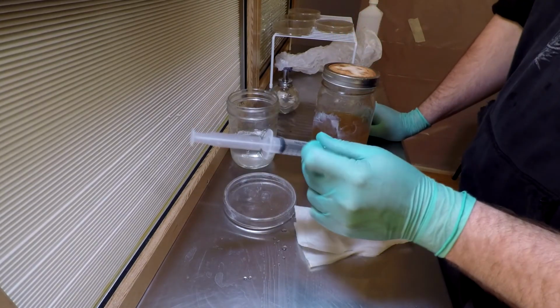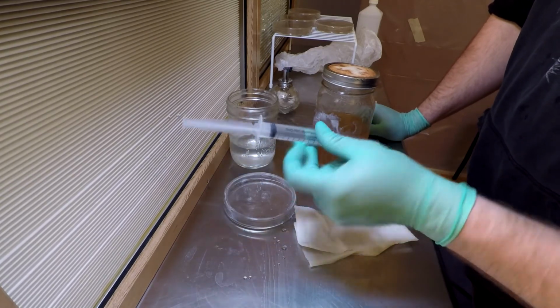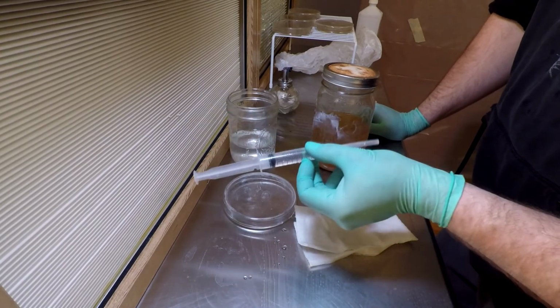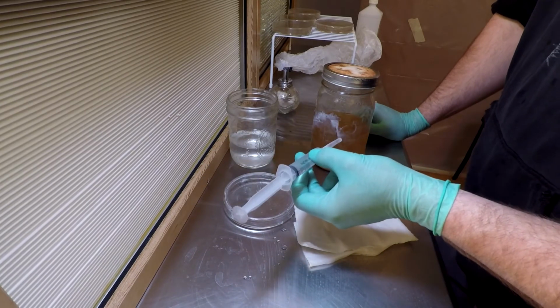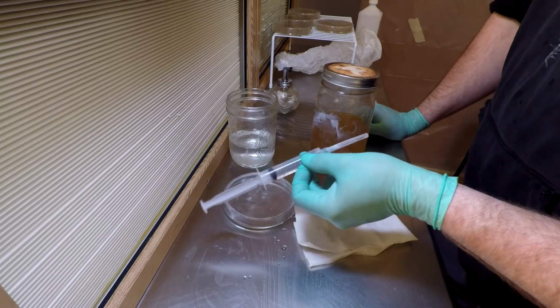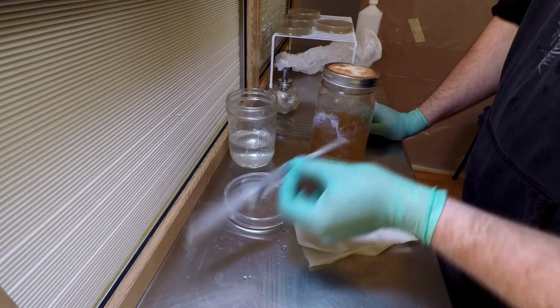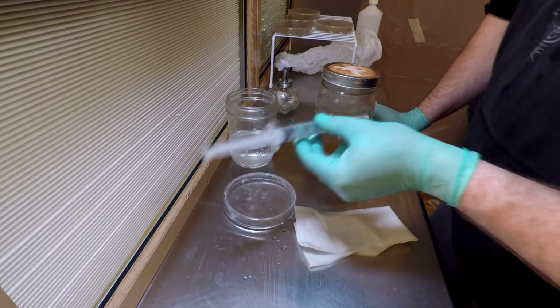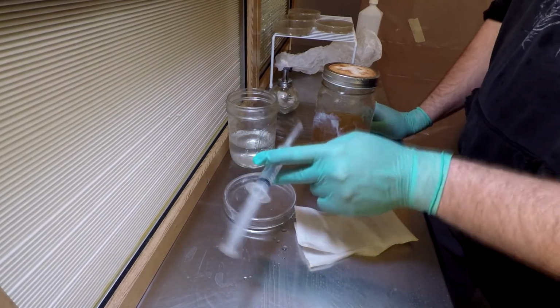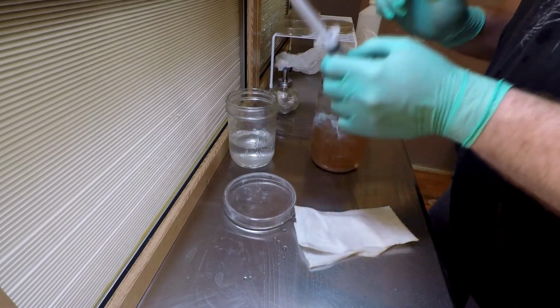It's the reason why if you buy a spore syringe online, you almost never see the spores in the syringe. You might see a hard chunk of spores clotted together, which a lot of times they'll do just because the spores they've used have been a bit dry and they rehydrated in a clump. They won't separate, but you still probably have the right amount in there when you squirt it out.